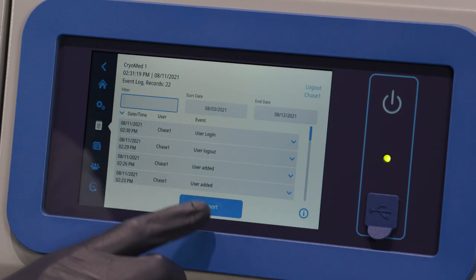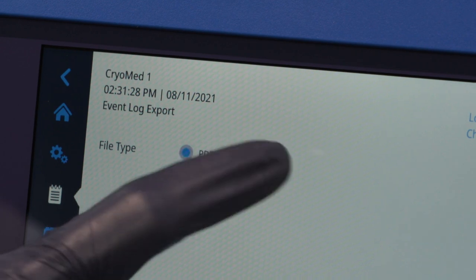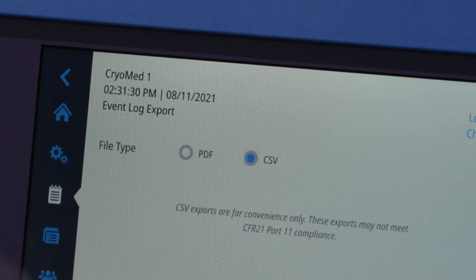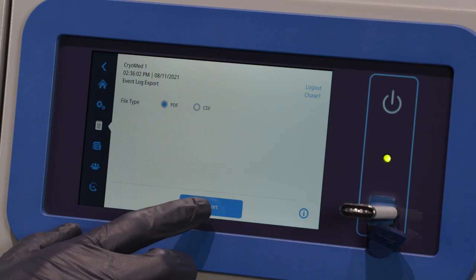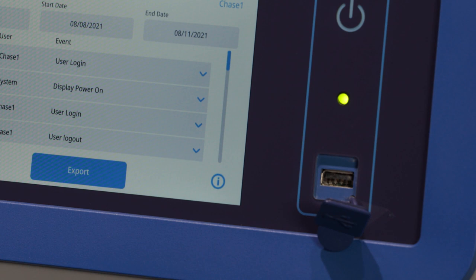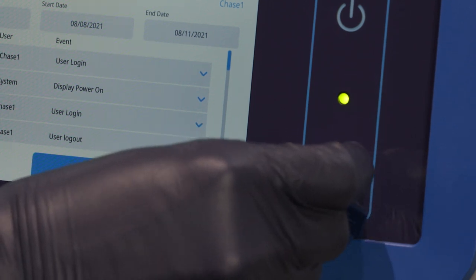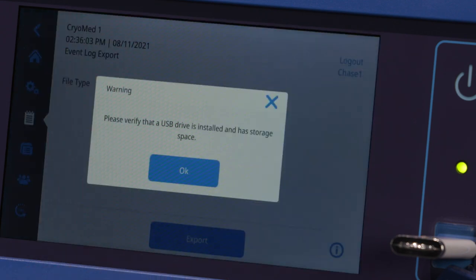When the list has been sorted and filtered, press the Export button. Select the file type for output — either PDF or CSV file types may be selected. Note that PDF is the only file format that supports 21 CFR Part 11 requirements. A pop-up screen will display indicating the export to USB was successful. Make sure the USB device is installed properly in the port and has enough storage space to record the exported logs. If the device is not properly installed or does not have enough storage space, a warning message will be displayed.